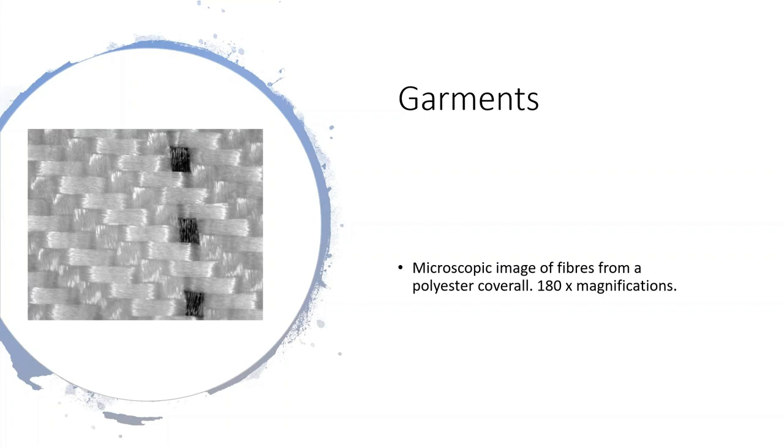So this is dependent upon the way by which the textile fabric is woven. The tighter the weave, the poorer the breathing capacity of the material and the less comfortable it is to use. On the other hand, the looser the weave, the better the breathing capacity and the more comfortable it is. But towards another extreme, then the ability of that gown to filter out bacteria and fungi but still allow sufficient air passage might be too weak. So understanding that, making sure that operators are comfortable but we do have the best filter efficiency, is a really important choice to make. And those of you who are microbiologists need to understand what the filter efficiency of your gowns are.